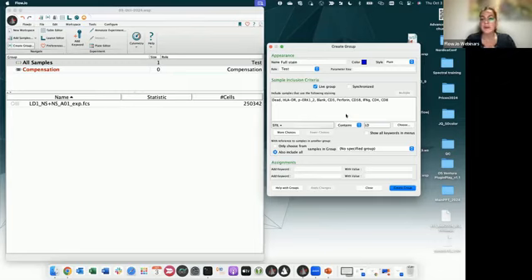So the live option will allow the group to automatically host all the samples that in their name contain the word LD. And this live option here is really important when you create a template.